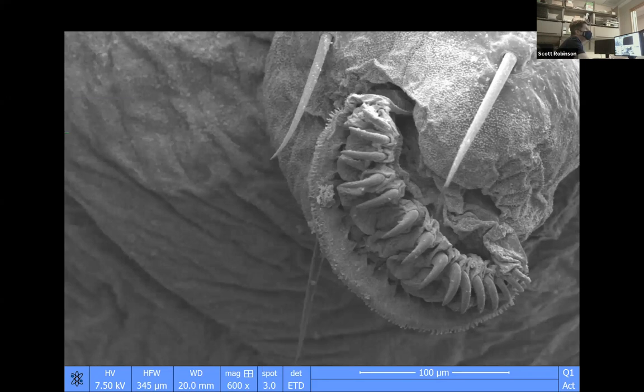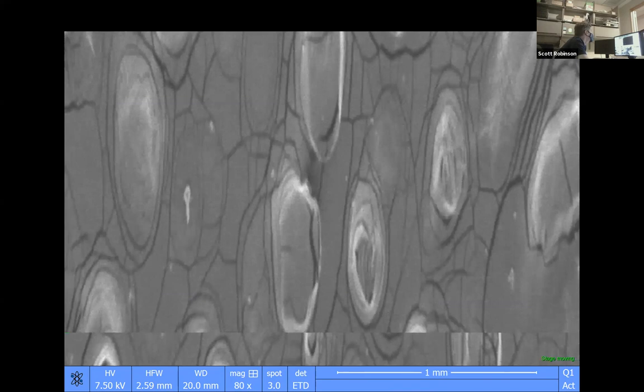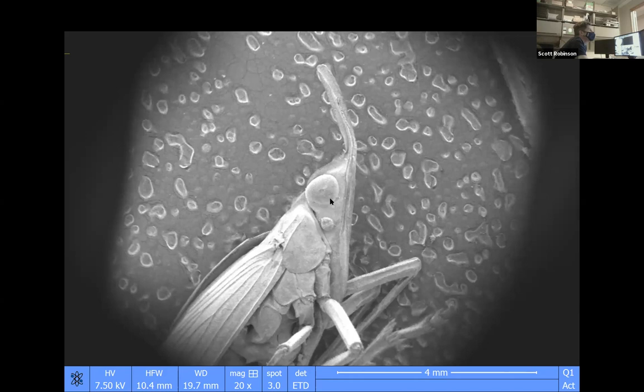So I have a request, Scott. I think I saw that there was a weevil with a question mark on the preset section. It'd be cool to look at that. I'm always a fan of weevils. What is this, though? Well, that's not a weevil. What is it? That's some sort of a hemipteran.